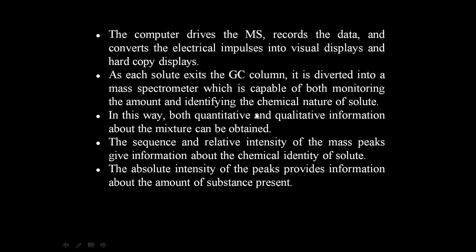In this way, both quantitative and qualitative information about the mixture can be obtained. The sequence and the relative intensity of the mass peaks give information about the chemical identity of the solute. The absolute intensity of the peaks provides information about the amount of substance present.